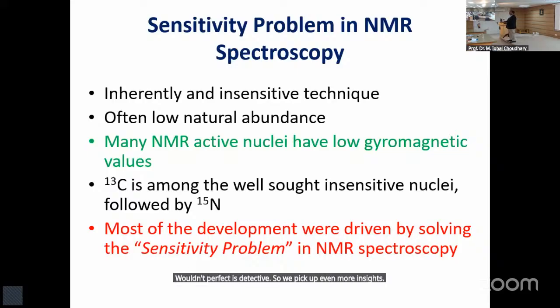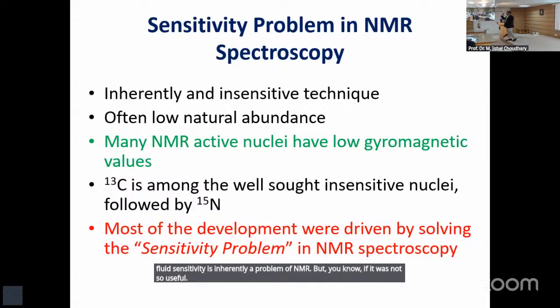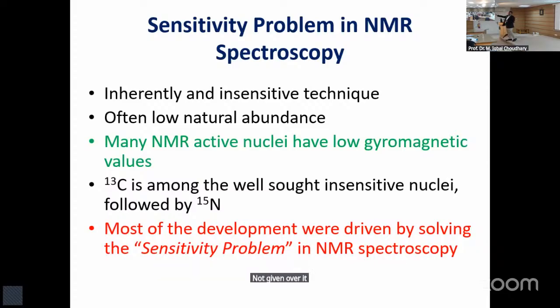So insensitivity is inherently a problem of NMR. But if it was not so useful, a long time ago it would have been buried in the scientific graveyard. People have buried techniques like that, like many techniques were buried in the graveyard.